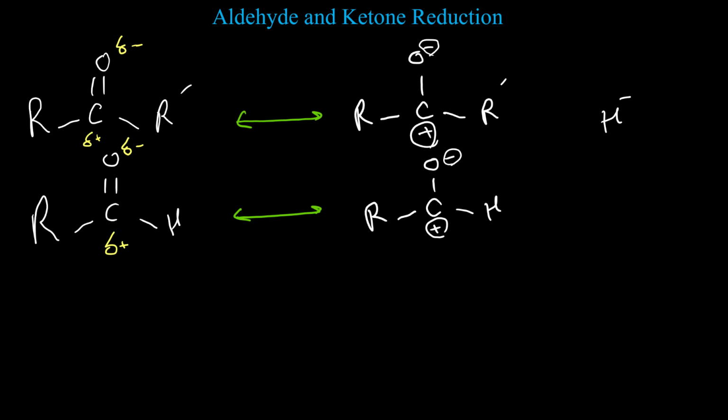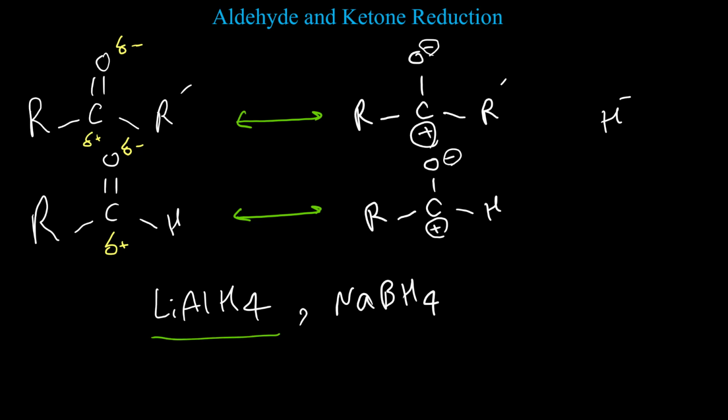There are two famous reagents, lithium aluminum hydride and sodium borohydride, for this conversion. Lithium aluminum hydride is very strong. It can react with aldehyde, ketone, esters, too many different functional groups, so it is not very selective when we want to only convert aldehyde or ketone. Also, performing the reaction with lithium aluminum hydride is a lot harder. We need to have the right solvents and we should control carefully, otherwise we can have an accident during the performing of the reaction. Because of that, we are not interested in working with lithium aluminum hydride as much as possible in the lab. So for this reaction, we are going to use sodium borohydride.